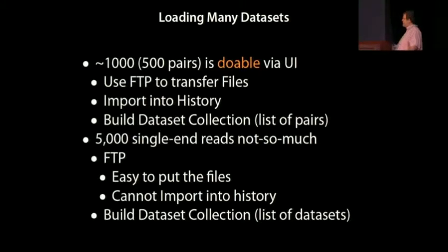Let me talk a little bit about the challenges that we have. Loading about 1,000 datasets into Galaxy is doable in the UI. You have to have a lot of patience. When you click on things and wait, it's going to take a long time for your UI to generate.